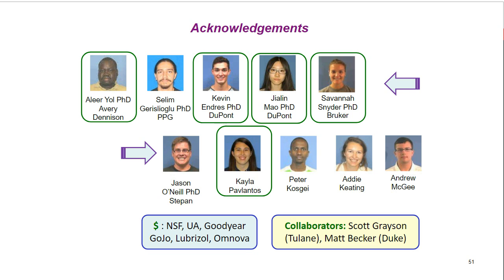So if your question was what percent can we detect with mass spec, I would say, let's say you have a mixture of end groups. You could go with mass spec down to the parts per billion. That's the difference now from NMR. That's what I was trying to convey with the table I showed in my talk. If you have a polymer that can have end group A and end group B, you can see B now, even if it was at the parts per thousand or parts per million level. It doesn't have to be high, because with mass spec the dynamic range is high and it's a very sensitive method, and because B will be at a different mass. There will not be overlapping. So that's another advantage of using mass spectrometry for those questions instead of another technique that looks at the bulk.